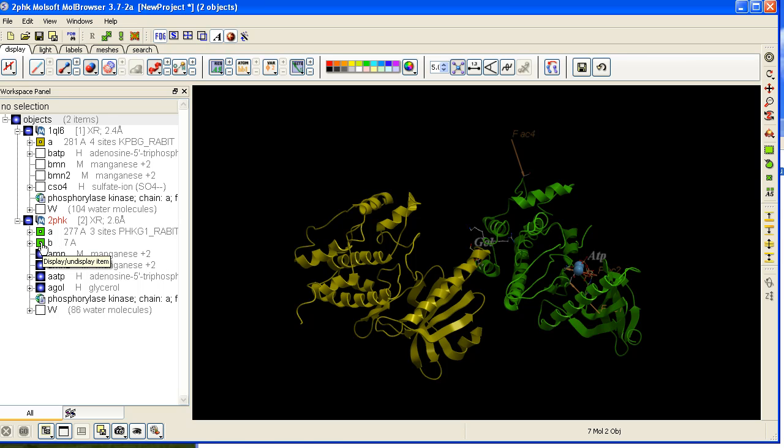So let's just display the A subunits and remove some annotation.